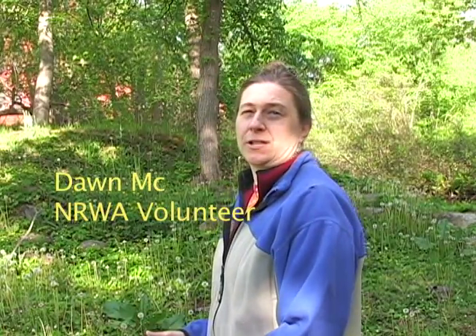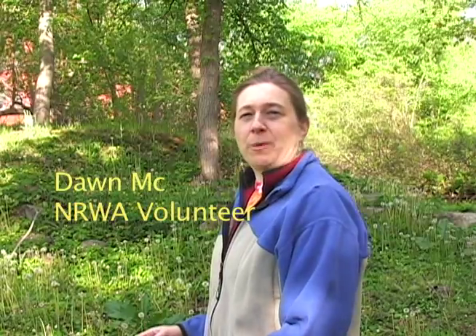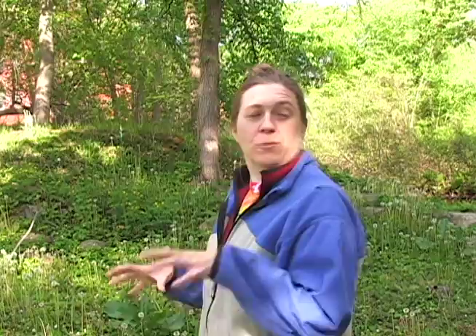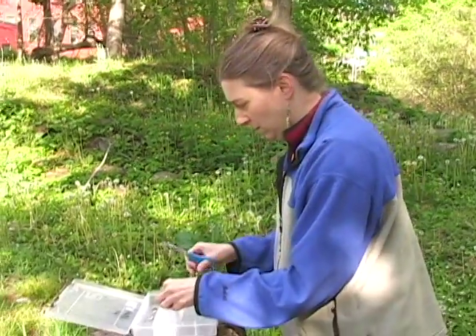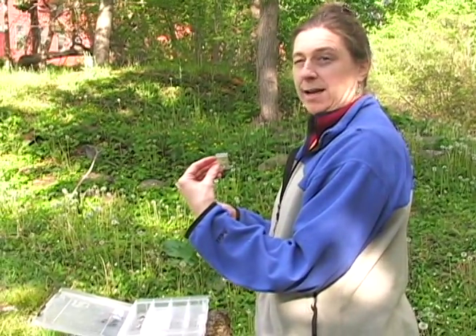I get to add reagents for dissolved oxygen. There's a packet for number one. There's a packet for number two. Those go in right as soon as you take the sample out of the water and get shaken up. Take it back to the lab and add the third reagent and then it's ready for further testing. So I'm going to add one and two right here by the stream. Each reagent comes with its own little labeled packet.